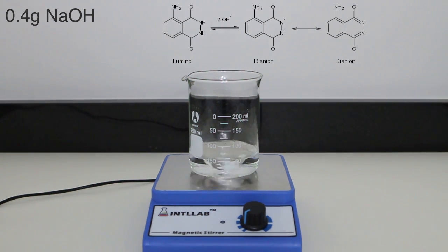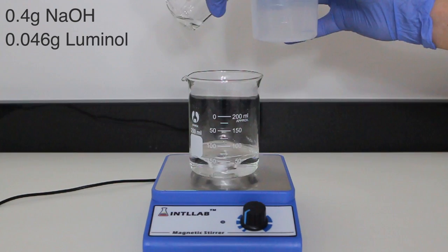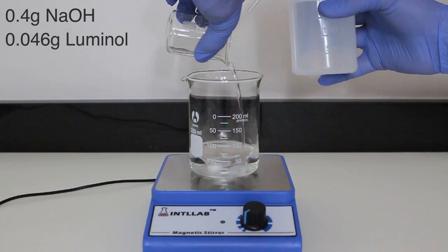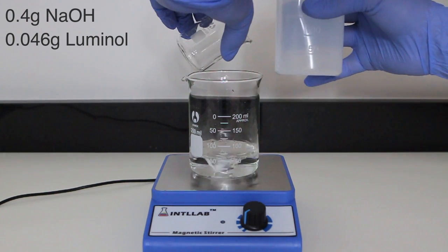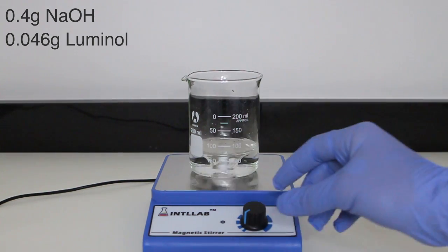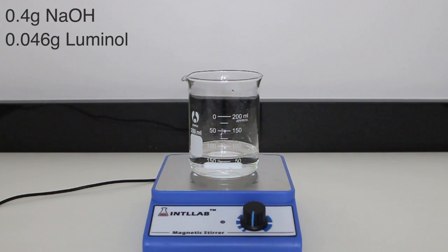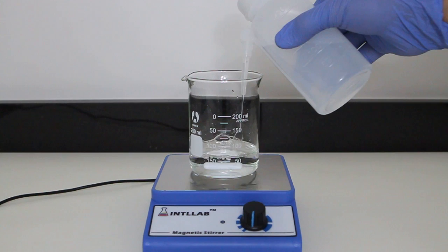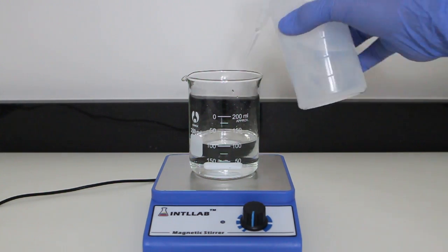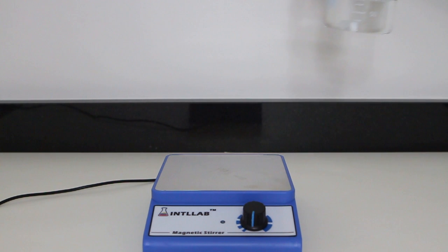I turn the stirring on and measure out 0.4 grams of sodium hydroxide. This is then added to the beaker and left to dissolve. After a couple of minutes of stirring, the sodium hydroxide is finally dissolved and I can add the luminol. We can now move on to adding 0.046 grams of luminol to the solution. This solution is then mixed well, and once the luminol has completely mixed, we finish by diluting the mixture to 100 milliliters. Solution A is now complete.